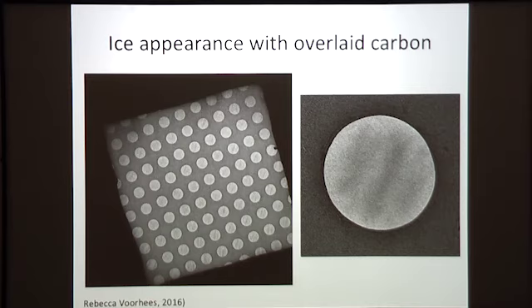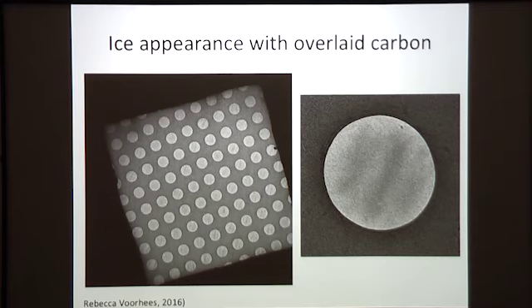What you're seeing here, the shadows, are basically, we think, wrinkles in the carbon, and then you get these mountains and valleys where some of the water stays and creates thicker ice. But this is usually where you find the nicest particles. This is true for ribosomes, and it's true for spliceosomes. I know that when Kelly was doing her spliceosome structure, the spliceosomes would like to accumulate at the interface between the thin and the thick ice, and that's where she would collect images. And you can see the little ribosomes here, which are quite visible at this magnification.